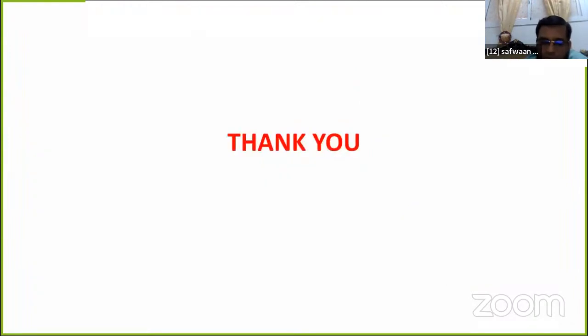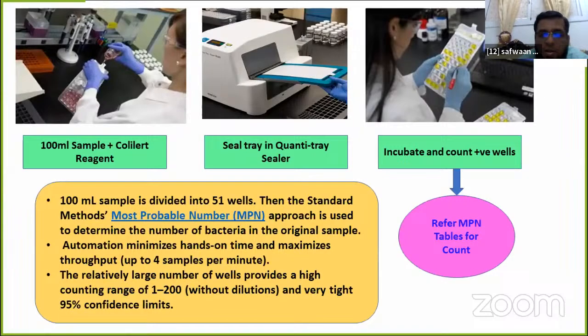This is the diagnosis of food and water, which we are doing in our laboratory here based on GSO, ISO, and FDA standards. If anybody is having doubt, they can ask me.